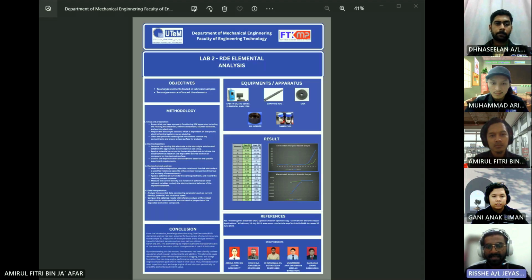Lubricating oil acts as a diagnostic medium carrying wear particles. Abnormal wear modes increase the concentration of wear metals in oils. Contaminants are detected, and mixed-up or degraded lubricants are identified by additive element concentrations. Multi-element analysis and knowledge of materials allow identification of distressed components.